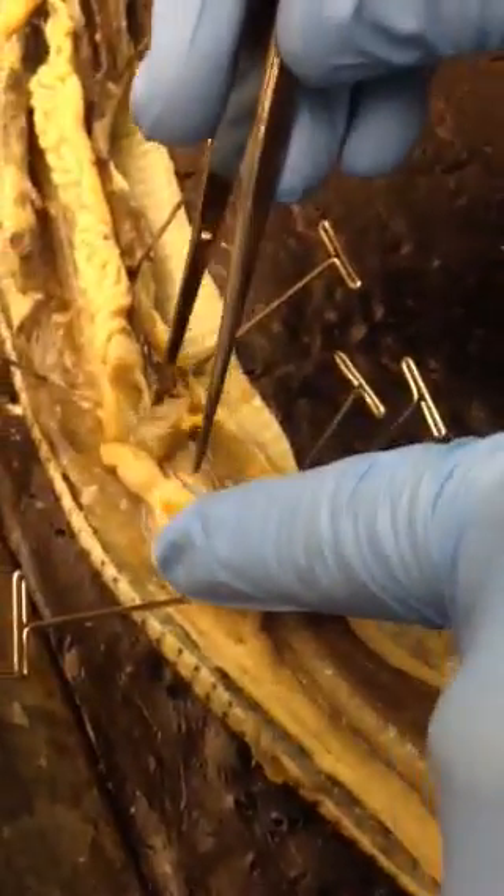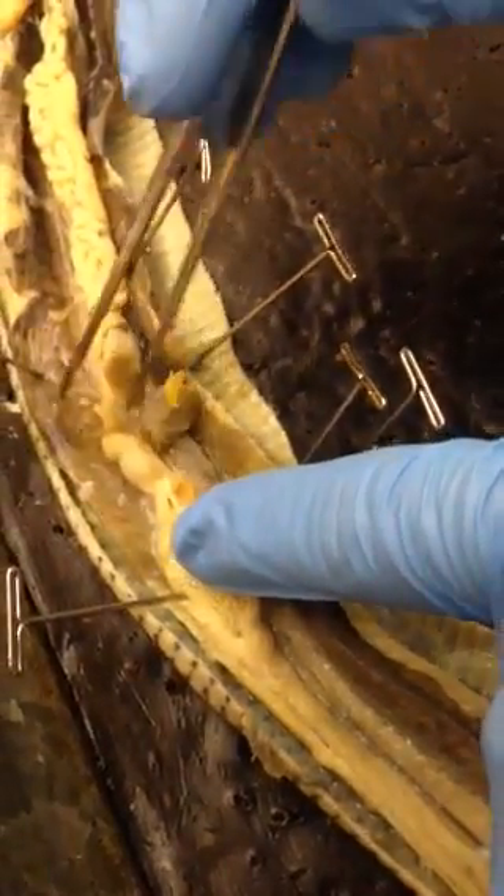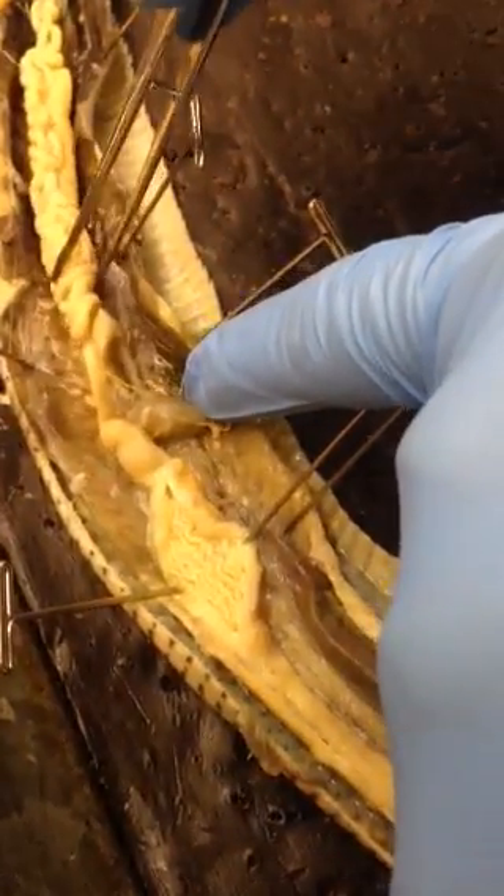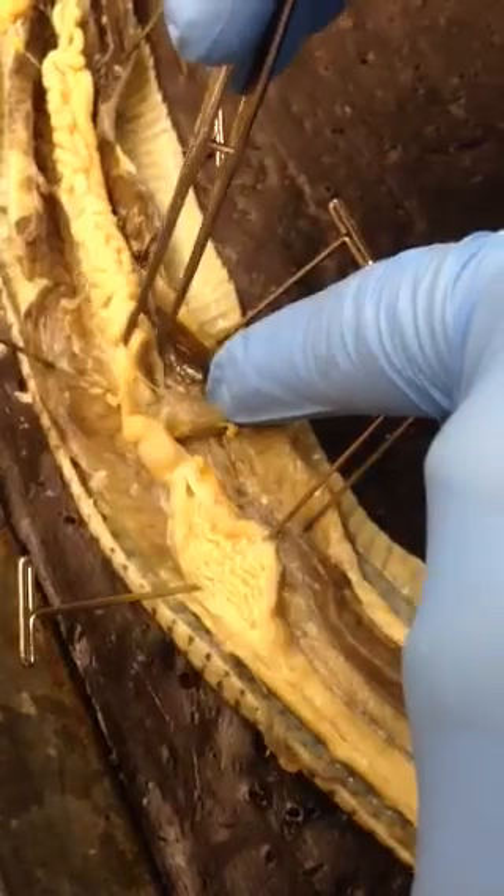Right next to the esophagus, this is the liver. At the end of the liver is the gallbladder right here. The stomach meets up with the intestine right here, and at this junction we have the pancreas right here.